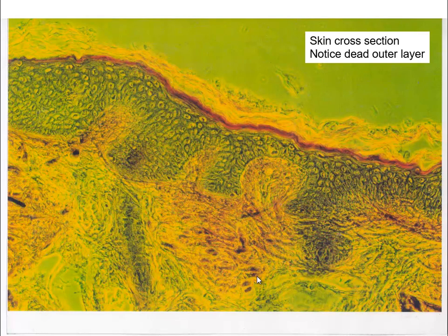Here's another cross-section of skin that I like because they've colorized it so you can easily see the various layers. If you look at those swirls — there should be about three on your screen — that's your fingerprint, which is different for everybody, even identical twins. The squamous cells are of course the outer ones. This person doesn't have much adipose tissue visible, so they must have had a thin hypodermis — probably an older person where fat has dissolved away from the skin, leaving it wrinkled because there's no fat layer to give it definition.